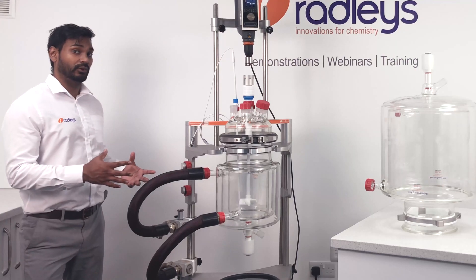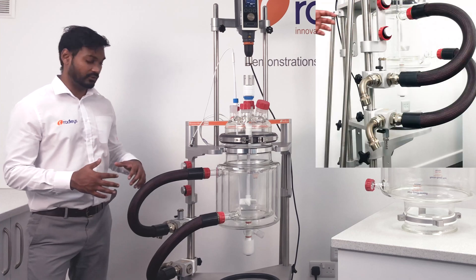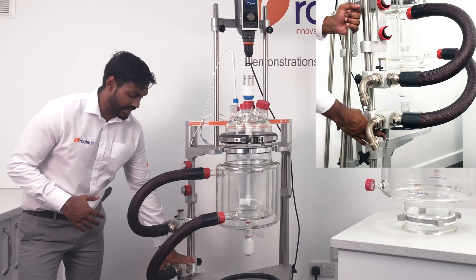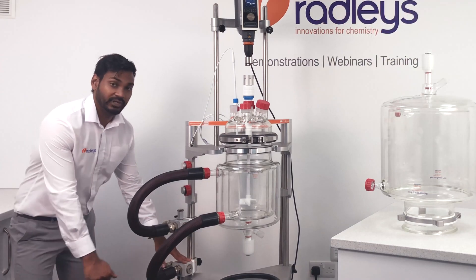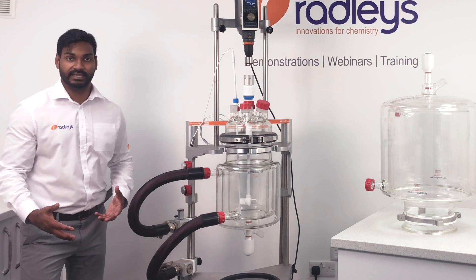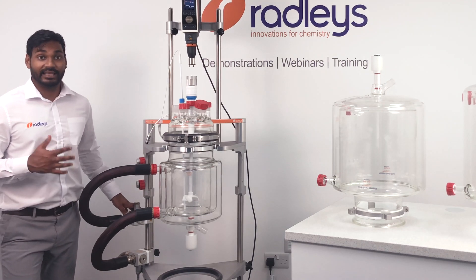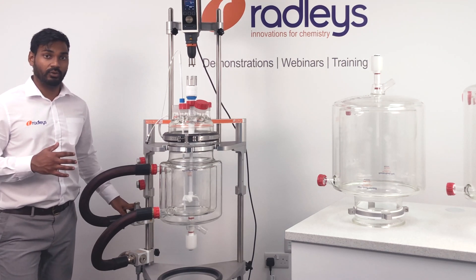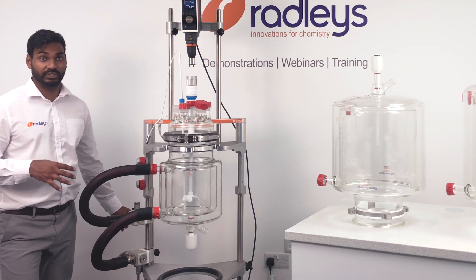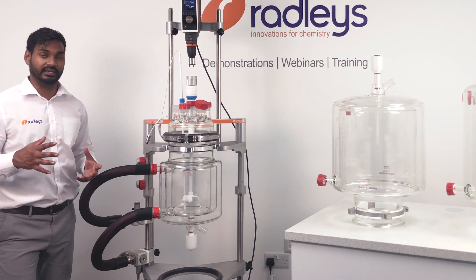The next step is to drain the thermal fluid from the vessel. With our system this can be easily done using the manifolds. The top manifold has an air vent on it, and the lower manifold has a drain valve with a hose barb that you can attach tubing to for draining the thermal fluid into an external container. The manifolds also support the weight of the hoses from the circulator, as these can be quite heavy. All manifolds have M30 connections which match the connections on most circulators appropriate for pilot-sized vessels.